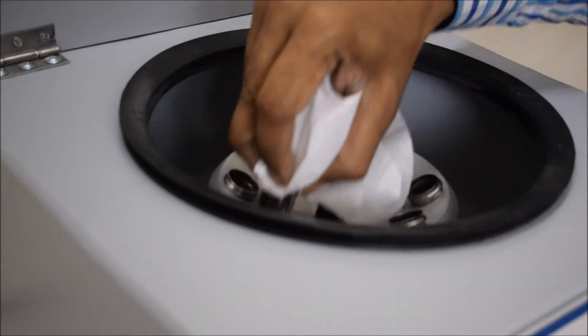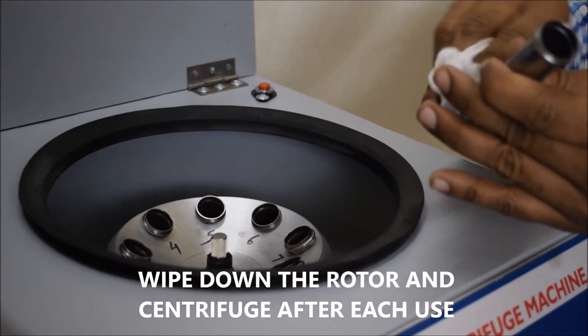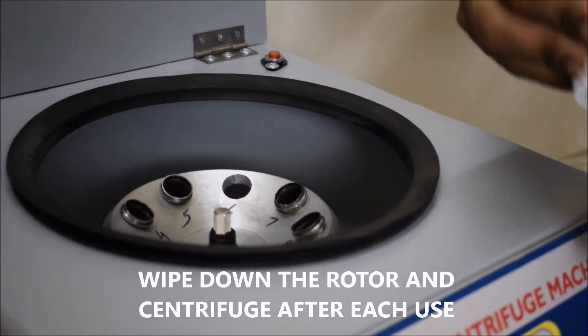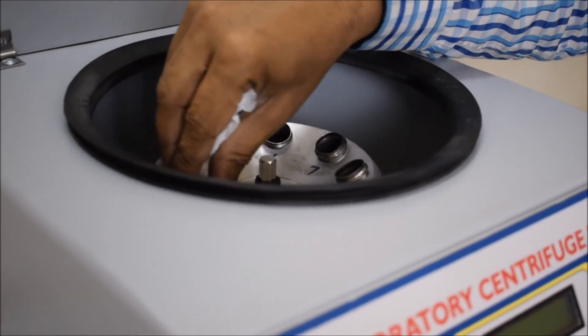Wipe down the rotor and centrifuge after each use. To keep the centrifuge clean and running smoothly, lightly clean the rotor and wipe down the centrifuge at the end of a run. When you are finished, leave the lid open for some time so it can air out and remain dry.